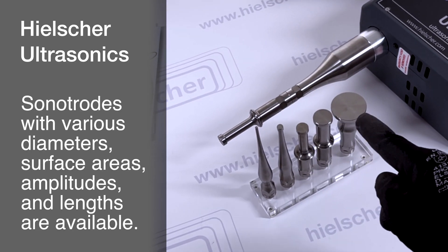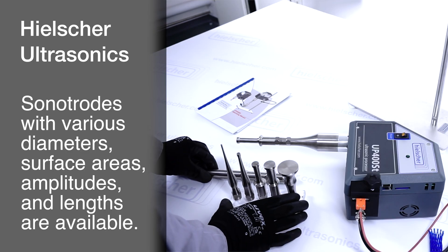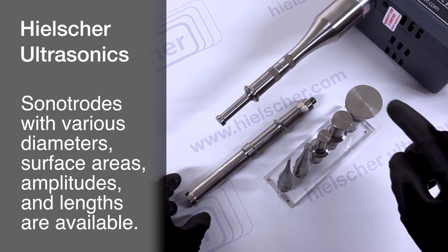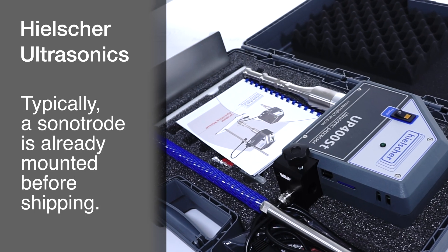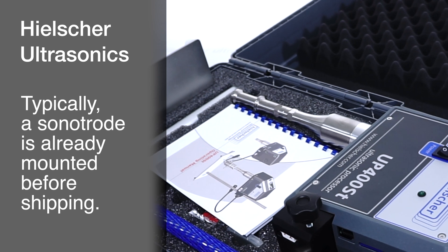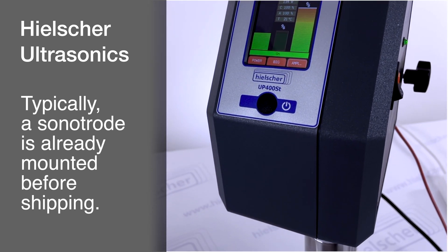Sonitrodes with various diameters and lengths are available for the UP400ST Sonicator. If you have questions about the best sonitrode for your application, please contact us. Typically, we pre-install a sonitrode on the device prior to shipment, so you can start sonication without additional setup steps.